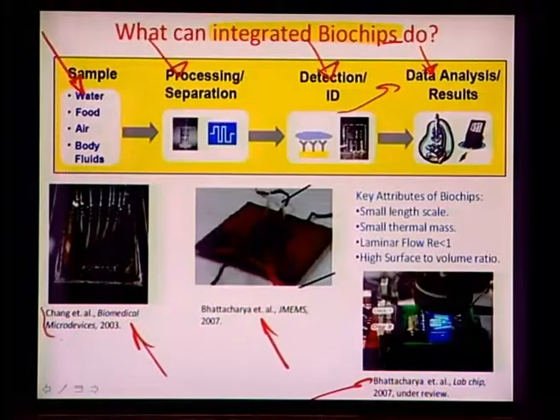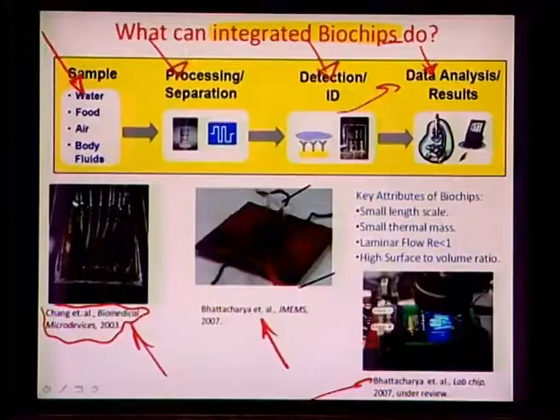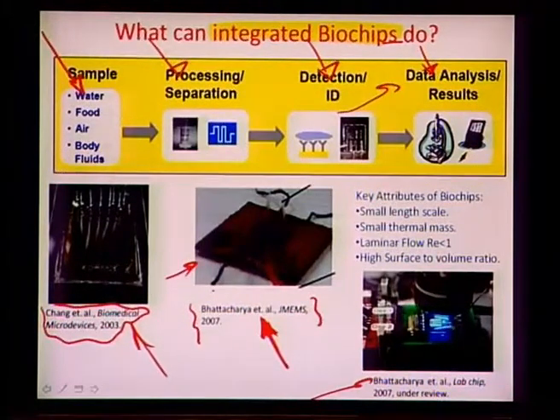This example is borrowed from the work of one of my collaborators, which got published in Biomedical Microdevices in 2003. This is about finding Bacillus anthracis on a chip scale using a PDMS silicon hybrid micro device structure. This example is from my own work, on a PCR microchip for doing rapid amplification of minuscule samples of viral DNA.